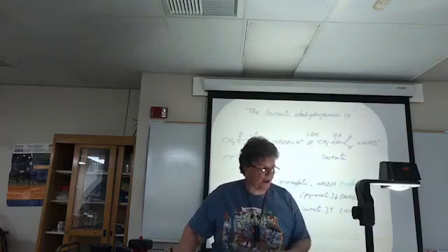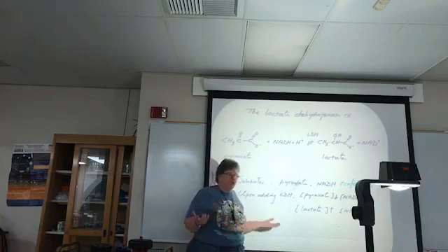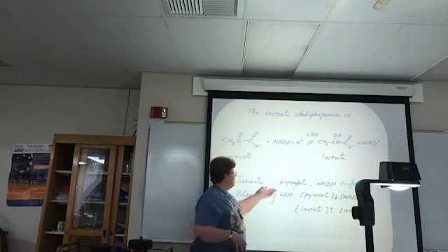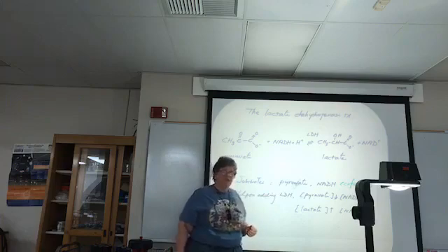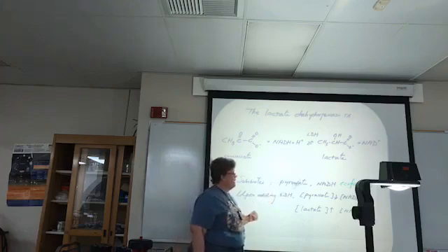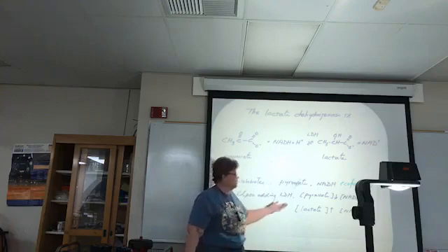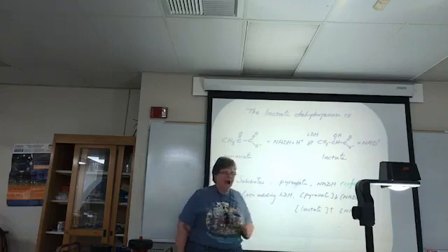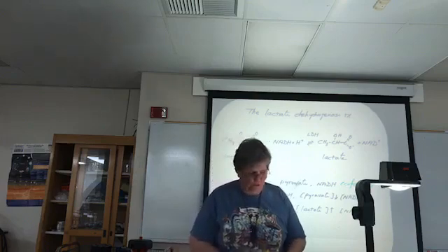The substrates for this reaction are pyruvate and NADH. NADH is also sometimes called a cofactor for the reaction. When you add LDH to the reaction, the concentration of pyruvate is going to decrease. The concentration of NADH is going to decrease. The concentration of lactate is going to increase because that's a product of the reaction, and the concentration of NAD is going to increase because the NADH is turning into NAD after that hydrogen is removed.